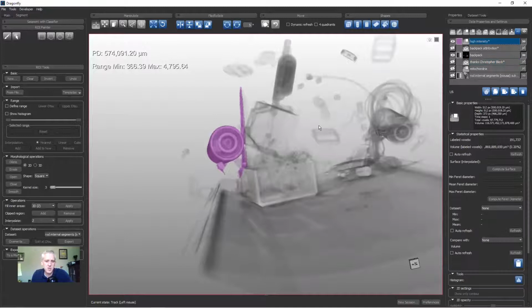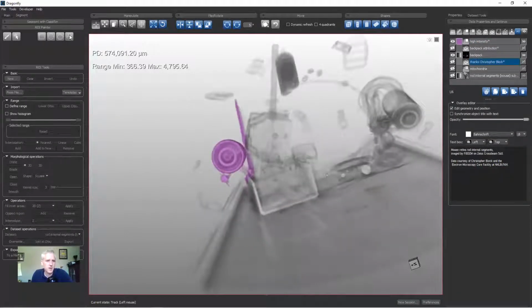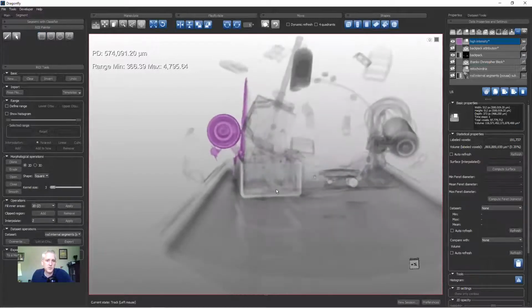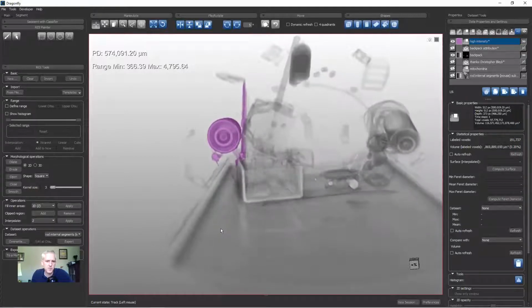So here I have this, and we've looked only at this tool, but let me select my region of interest. We've looked only at the freehand tool, but the other region tools work as well. So if, for example, I wanted to use a rectangle tool so I could get a nice straight line, it is going to be aligned with your monitor, shall I say. So if I use this and I hold down Shift and drag, then it's going to erase all of those pixels. So you can do some things like that.